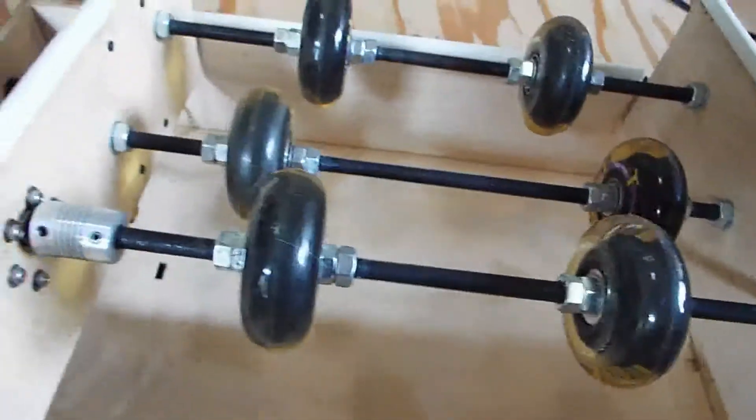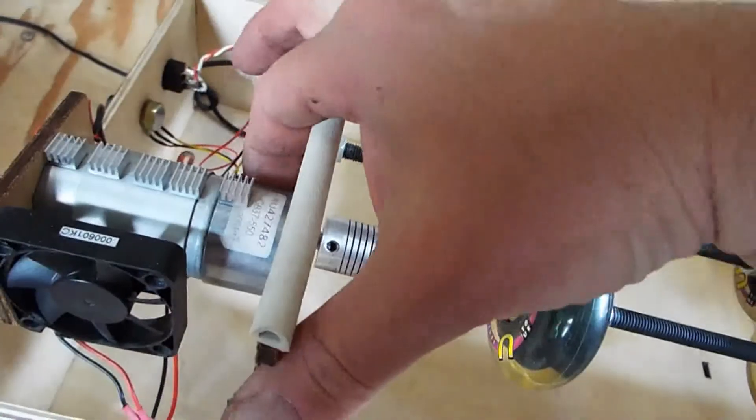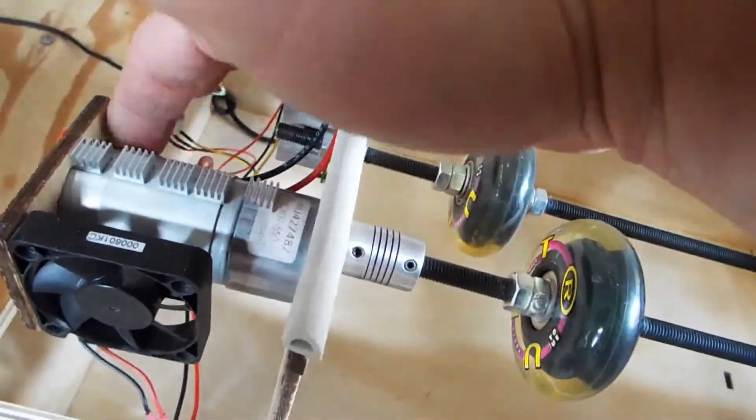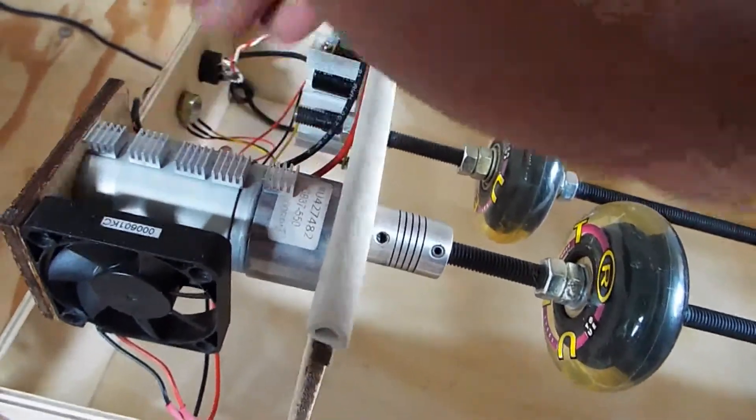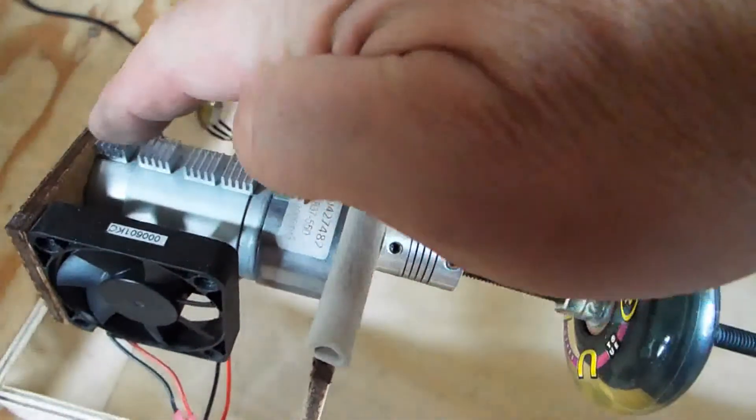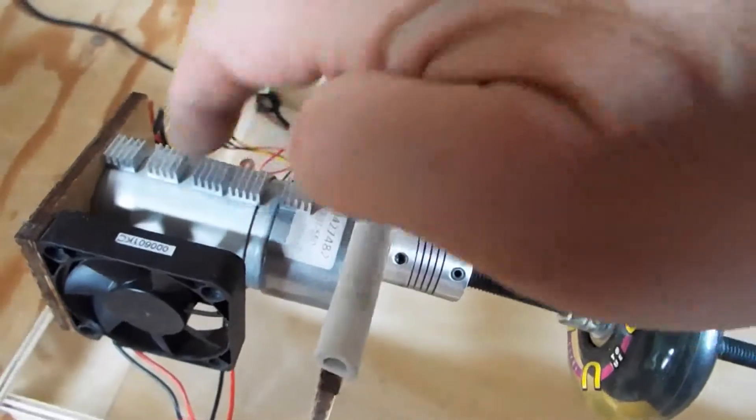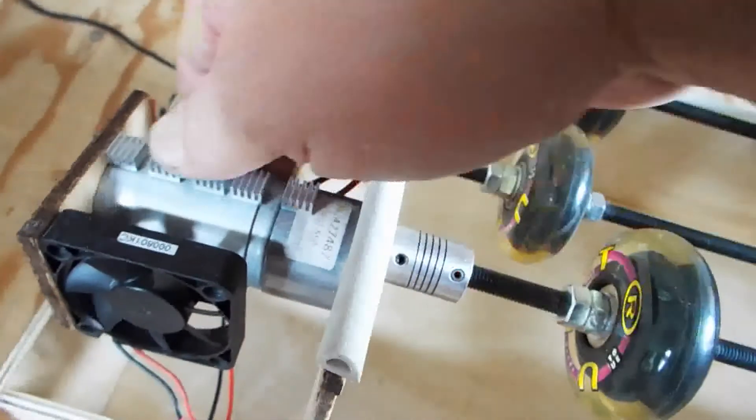And when I made this, I used a 300 RPM 12 volt DC, it's like a 5 or 8 amp gear head motor here. And I have heat sinks on it to help cool it just a little bit with a little fan here that runs.